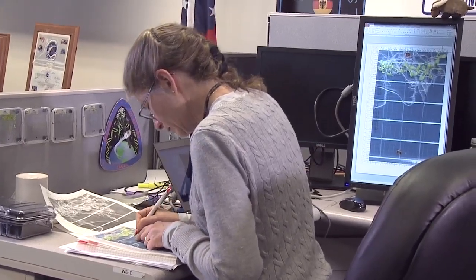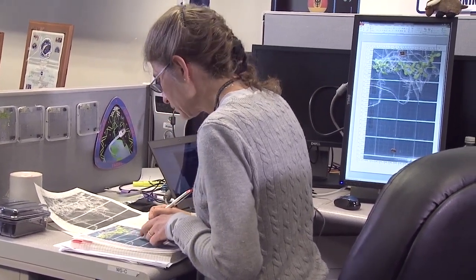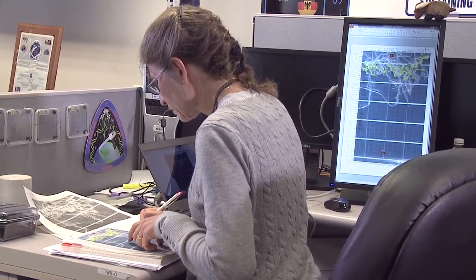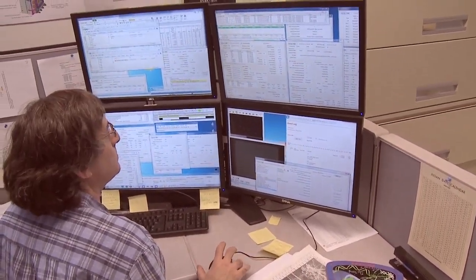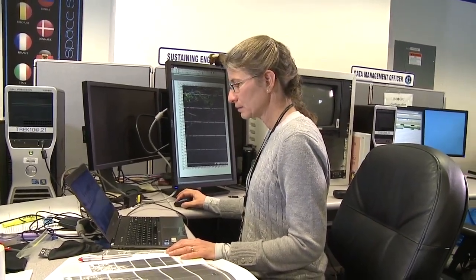As a laboratory, we are plant molecular biologists. We're interested in spaceflight as a novel environment, as something that's outside the evolutionary experience of plants. And what the Apex 3-2 experiment does is look at Arabidopsis thaliana and how it responds both at the molecular genetic level, as far as what genes are turned on and turned off biochemically, and also using live imaging with the LMM, the light microscopy module, to look at specific reporter genes we've engineered to give us specific locations for where these genes are active in real time.